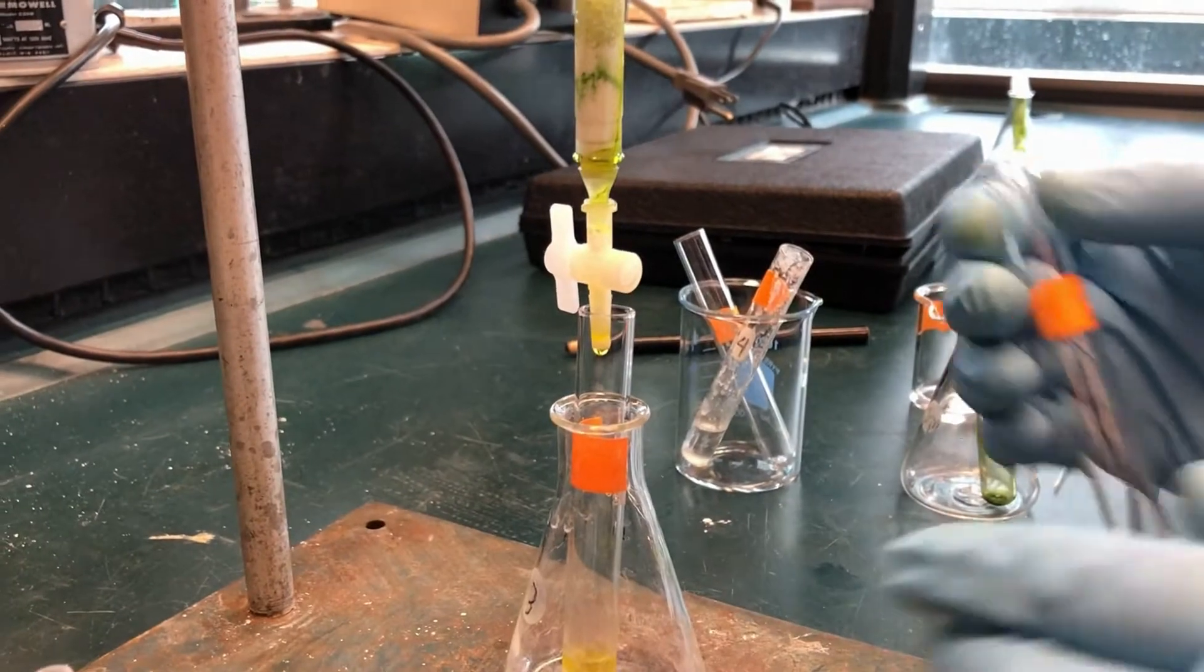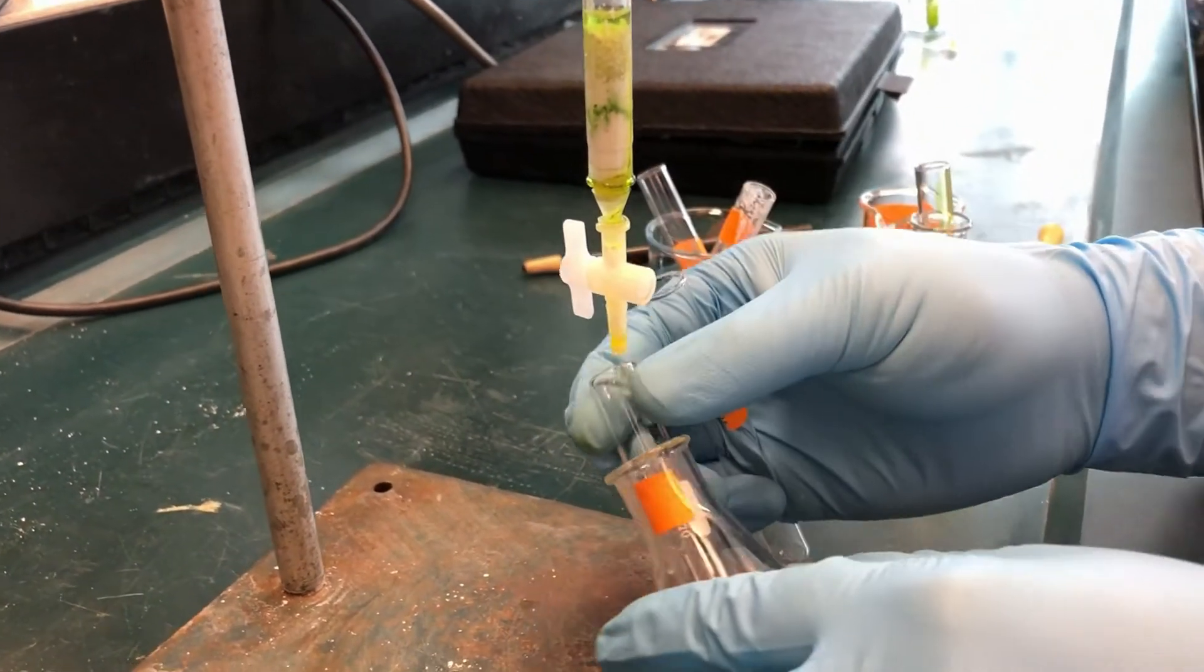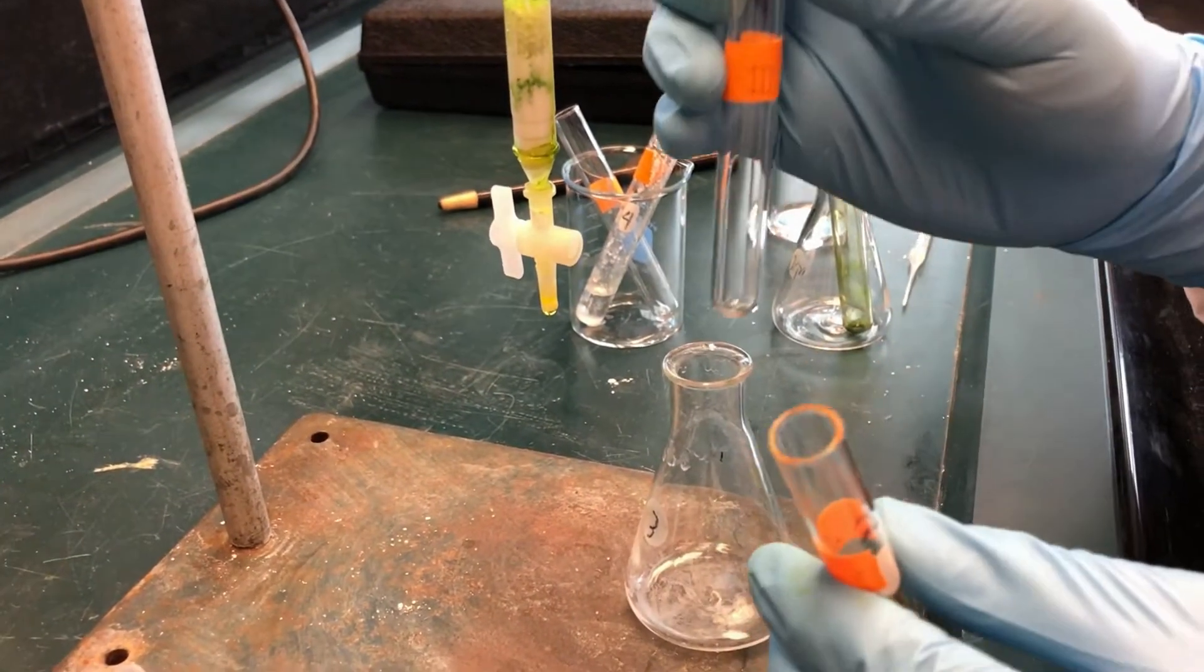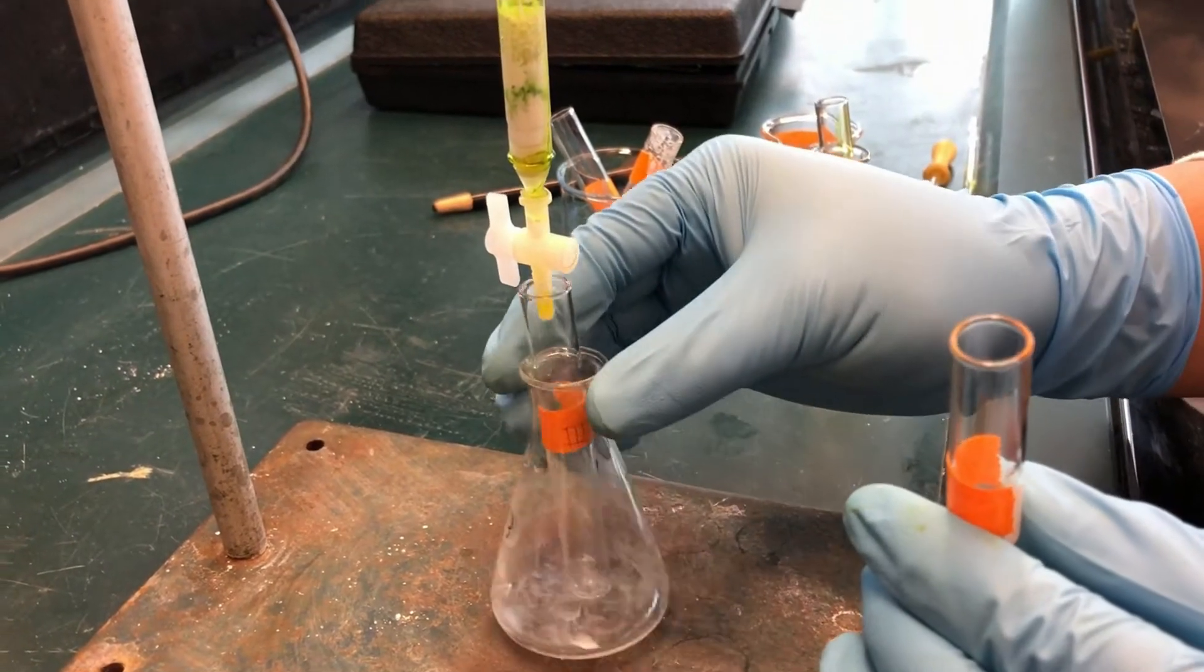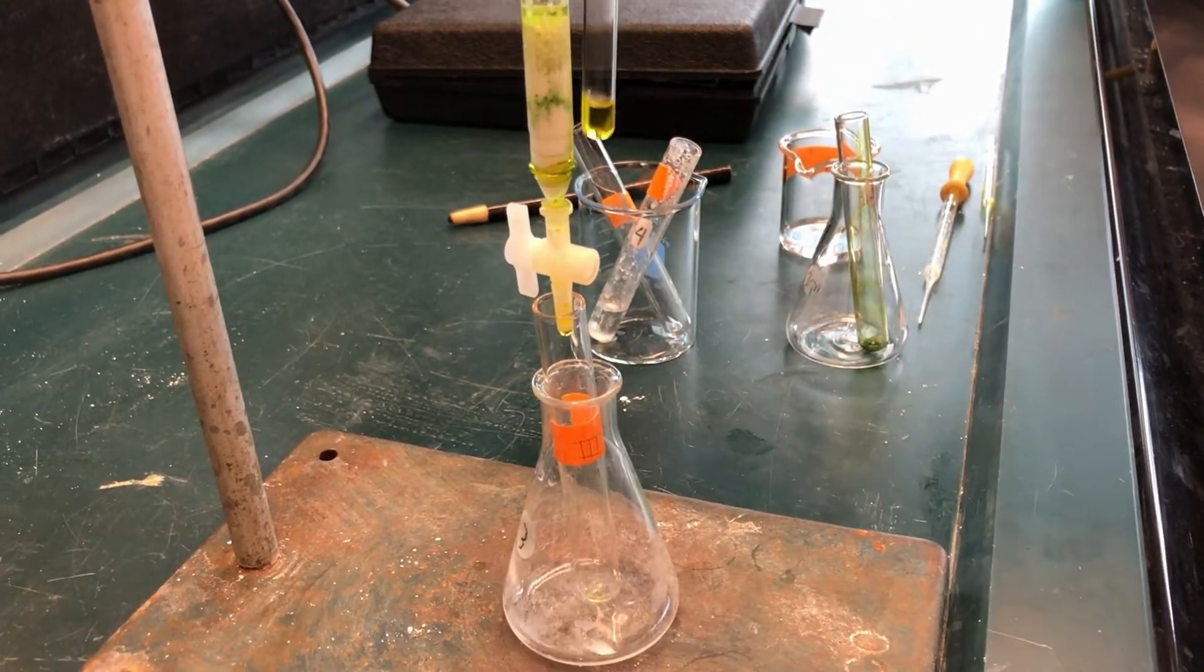After you have collected the yellow pigment, switch to test tube 3 to come back to the column to collect the intermediate between the green and yellow pigment until you can see the green band moving down the column.